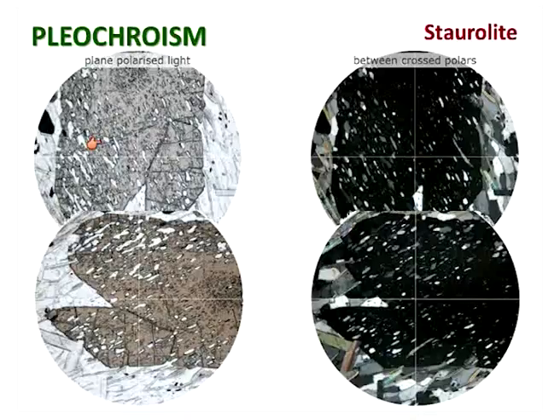But then if you turn that crystal through 90 degrees, you can see that it really does look a very definite, matte, uniform grey. And you'll notice that because staurolite has more or less straight extinction here, you can see that those north-south and east-west views in cross-polars both show extinction colours, so the black colour of extinction.